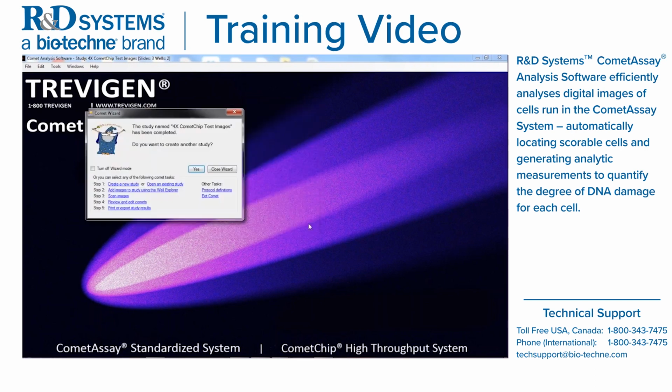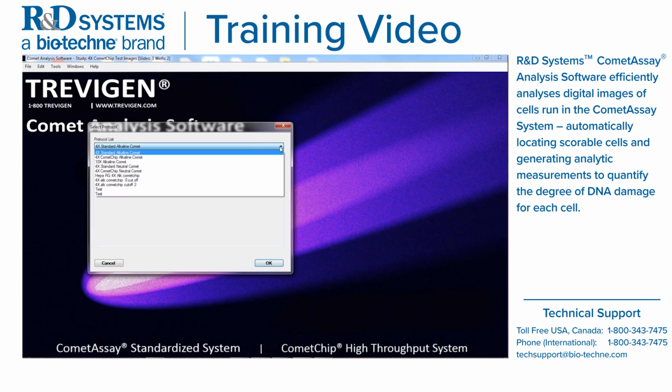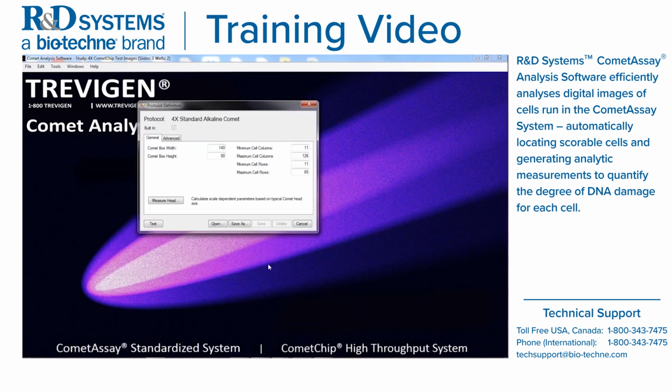All right. So now what you can do is you can go back under these protocol definitions. You now have a new protocol called Test, which you can use to run your images. You can also, let's look at some of these default protocols. I want you to notice that you can never, ever delete this. This is a default protocol. It's a built-in. It has a check mark. And so you can never delete it, and you can never overwrite it because these are marked out.